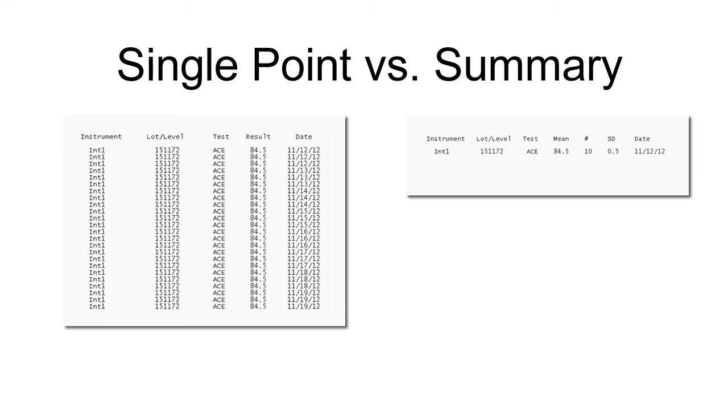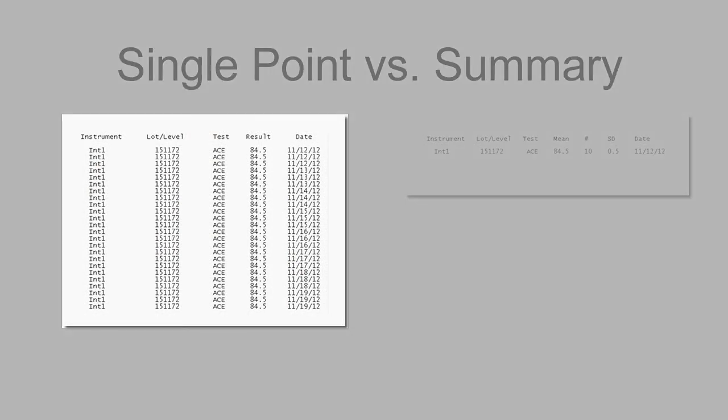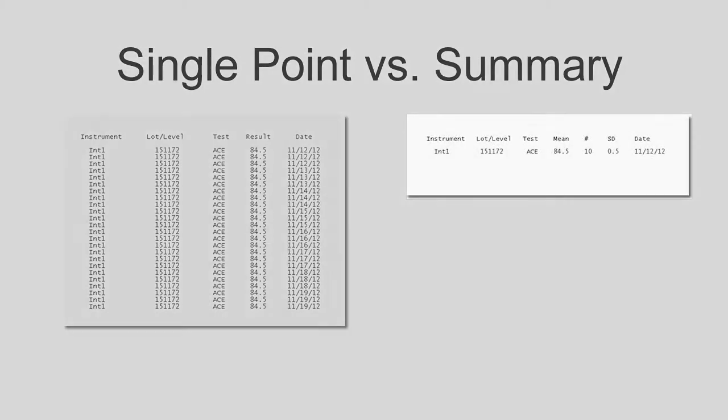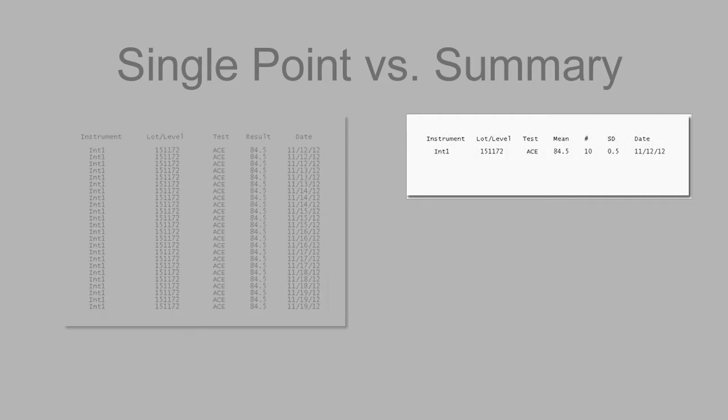There are two methods for data entry. Single Point requires you to enter individual points for each test. Summary data entry includes a mean, SD, and number of points for each test.